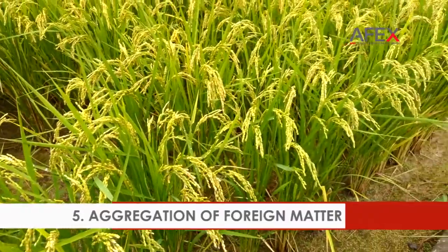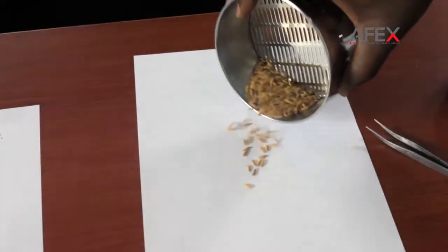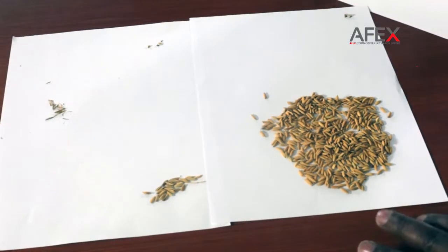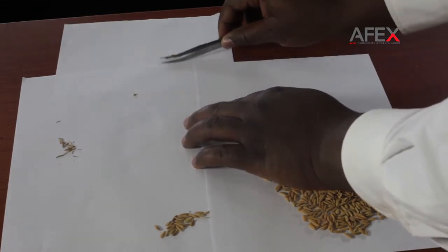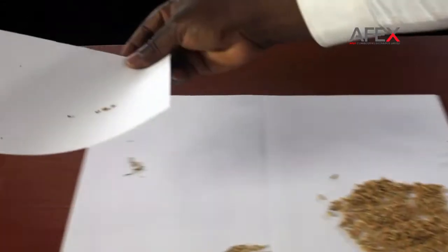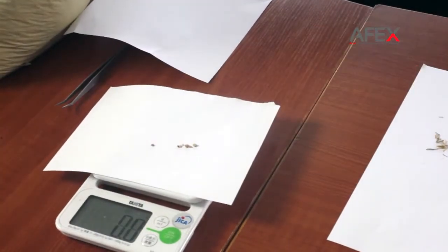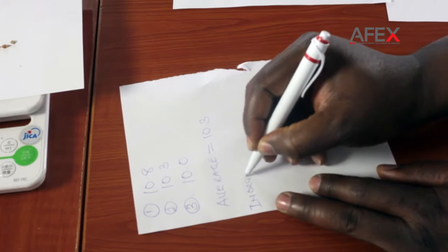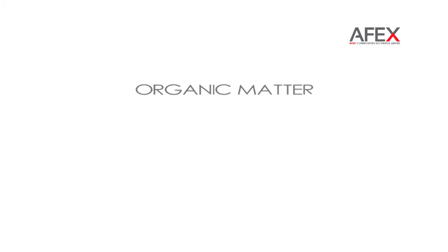Aggregation of foreign matter. Combine the foreign matter from the sieve process and those from manual separation. Measure and record your results. Do the same for the inorganic foreign matter. Determine the percentage of organic and inorganic foreign matter in the original sample.